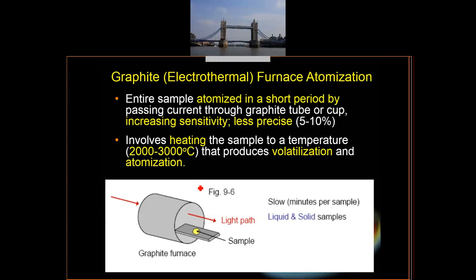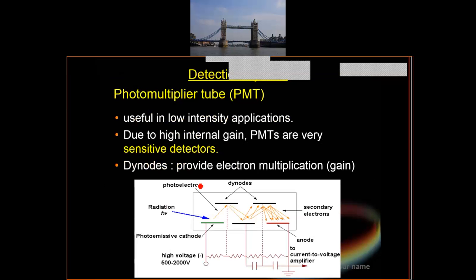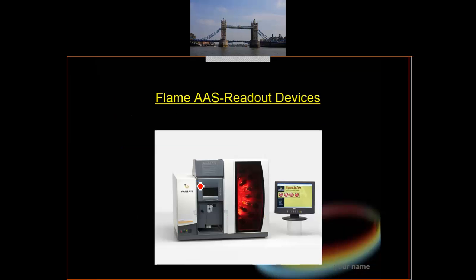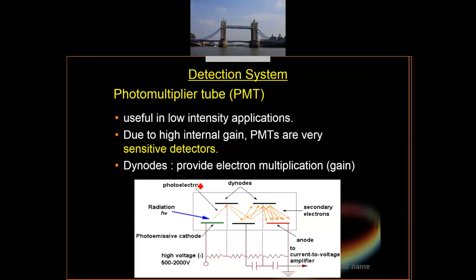Okay, this is the other technique using furnace. Furnace, just like when we want to produce the proximate, want to get the result for minerals, the same thing. Okay, for detector, we also use the photomultiplier tube, same as UV visible, using the same photomultiplier tube.